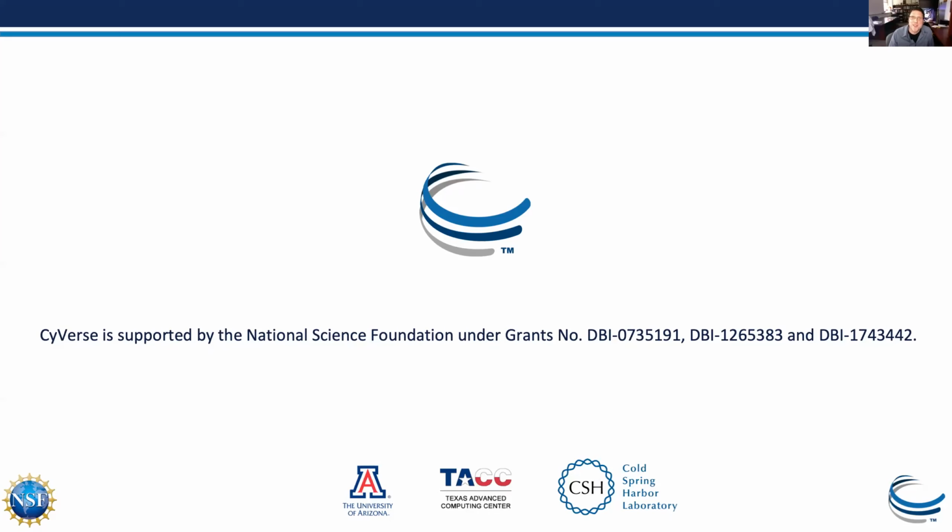When we were practicing, Shelley asked me, what is the limitation on each of these? What size genomes can you use? I can touch on that. With Circos, there really isn't a limit because it's summarized data. It's the additional data that you add that is going to be limiting. But for PatMatch, I can safely report CyVerse can handle the largest current genome, which is the sugar pine, at 30 billion nucleotides, the largest assembly I know of.